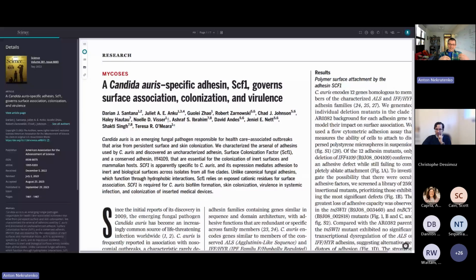Most of the data that you can find for Candida auris, there are really 2 types of data sets in NCBI or the Sequence Read Archive. That's the whole genome data sets generated by state health agencies. There's a lot of data going in that sense. Plus, there's a lot of RNA-seq data sets.